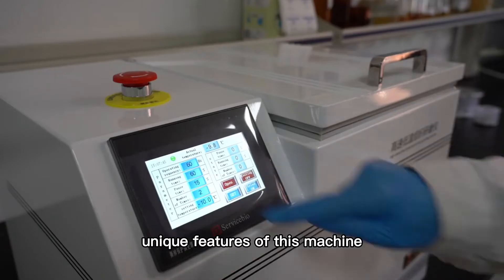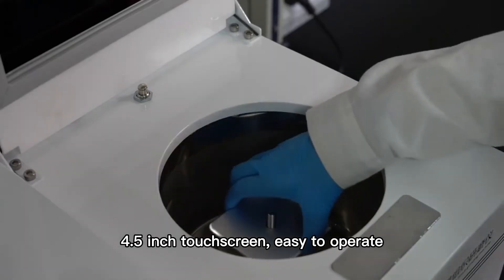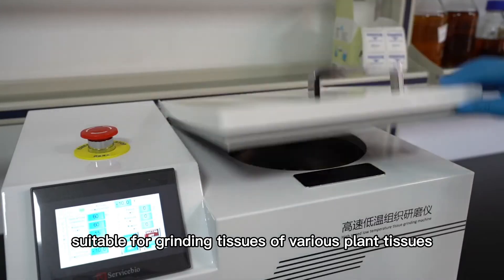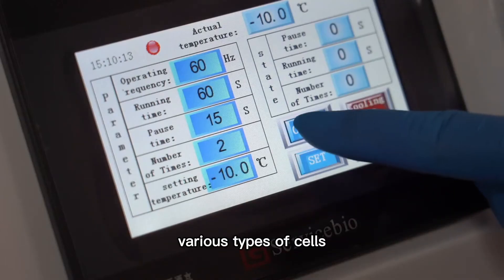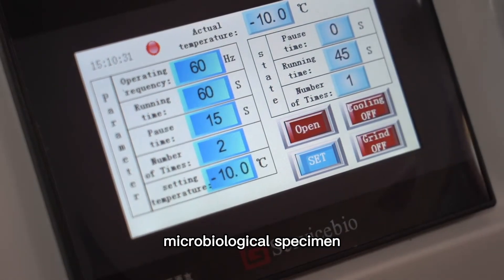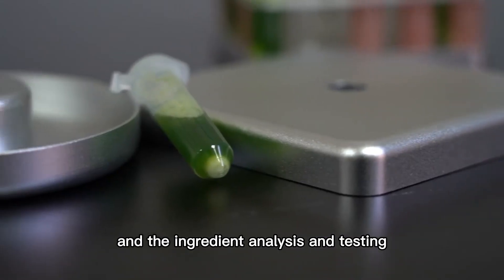Unique features of this machine: 4.5-inch touchscreen, easy to operate. Suitable for grinding tissues of various plant tissues, animal tissues, various types of cells, microbiological specimens, as well as grinding food and drugs in ingredient analysis and testing.